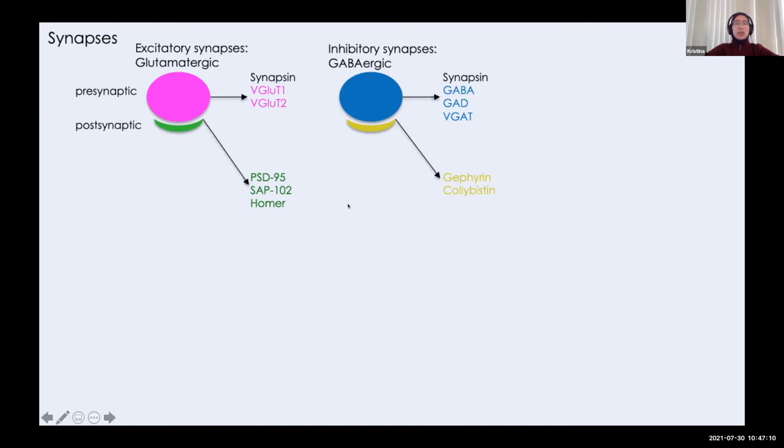A lot of our work is with synapses in the mammalian cortex, and that's what I'll show you as a first example. We have developed panels to mark different compartments. Of course, synapsin is one very ubiquitous marker for any kind of synapse in the cortex. Synapsin labels excitatory synapses and inhibitory synapses.